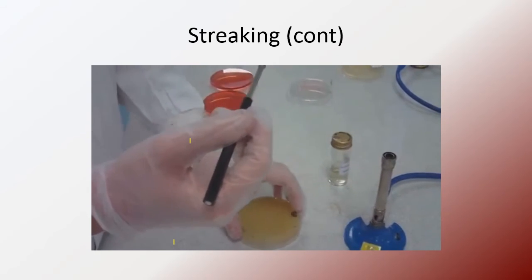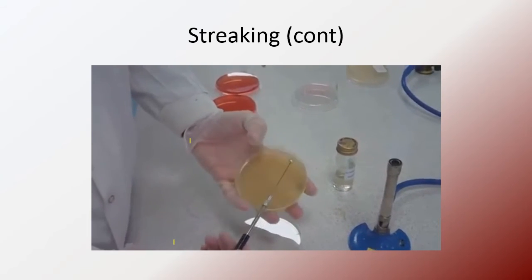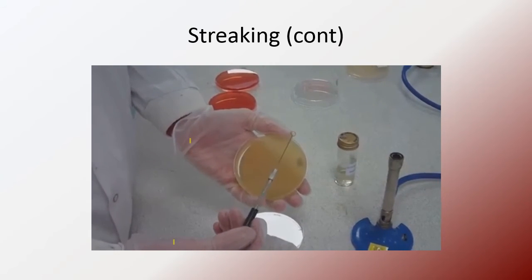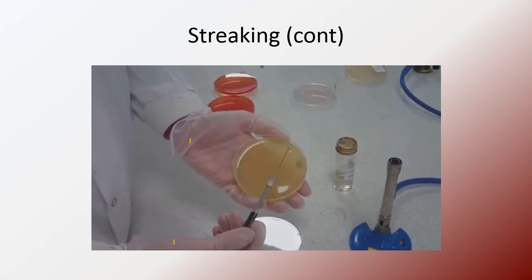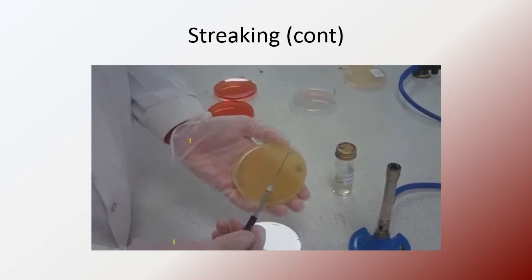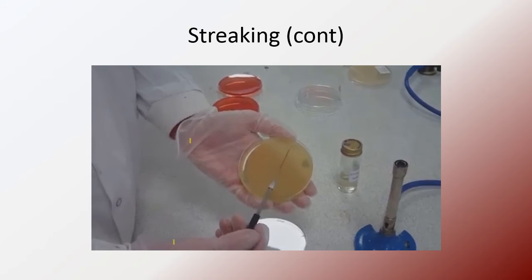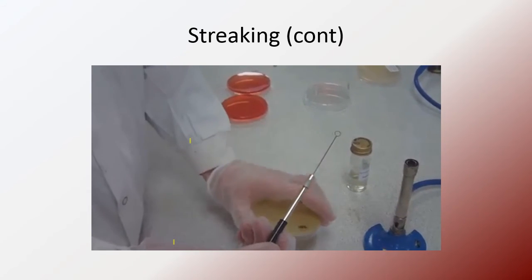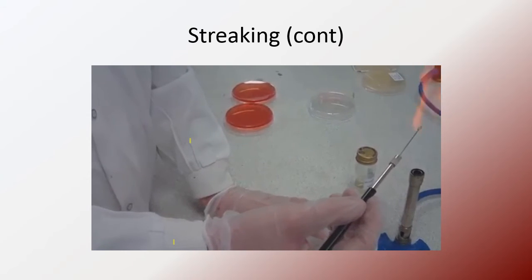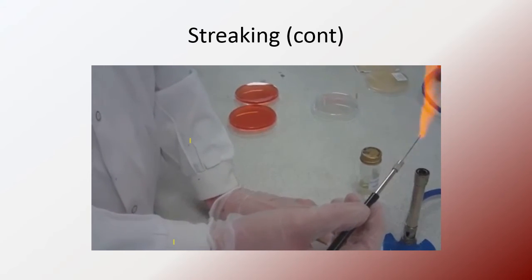Partially lift the lid of the petri dish, and with the loop containing the bacteria, rub a small circle immediately into the agar on the first dot at 12 o'clock to prevent your liquid from running. Reflame the loop and let it cool for 5 seconds by touching an unused part of the agar surface close to the edge of the plate.